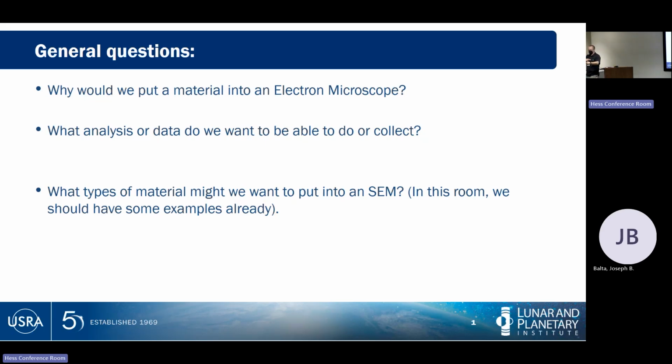So see what we kind of did there, okay? Now, nothing that we necessarily did wrong, but we're trying to make sure that we know what it is we want to put in the SEM and what we want to do with it. Because if I want to take an organic compound and put it into the SEM and then catch it in the act of drying, there are probably, I guarantee you, there are electron microscopes in the world that could be built to do this.